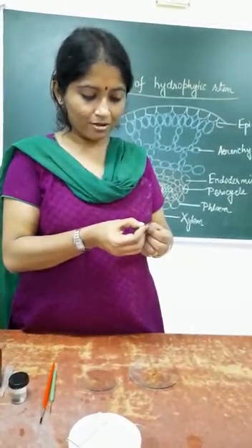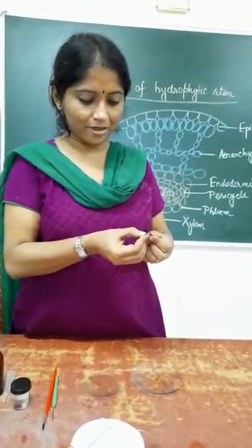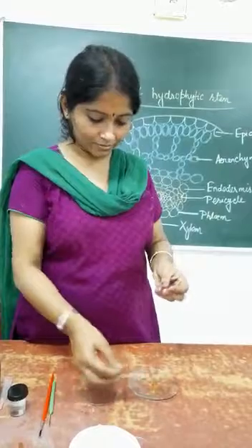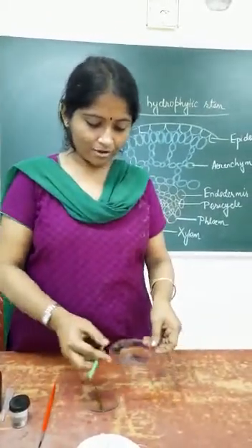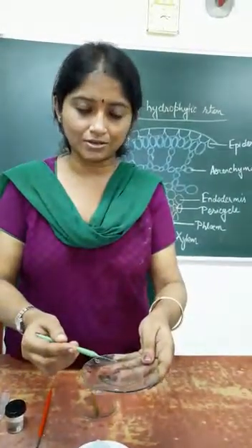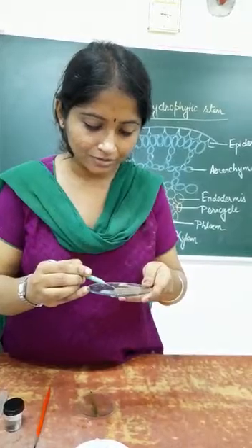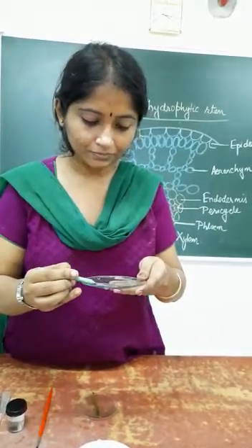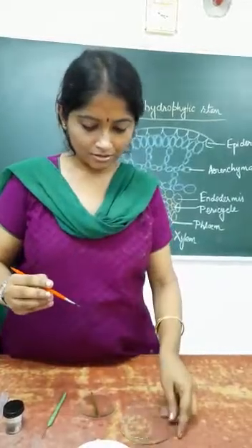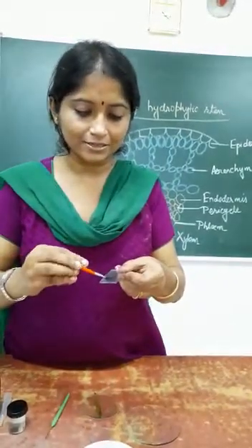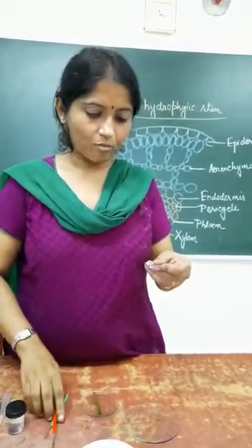The thin sections will be placed in the watch glass with water. I will make a few such sections so that I can select the best one. From the sections here, I will select the thinnest section and keep it on a clean slide. Add a drop of water.